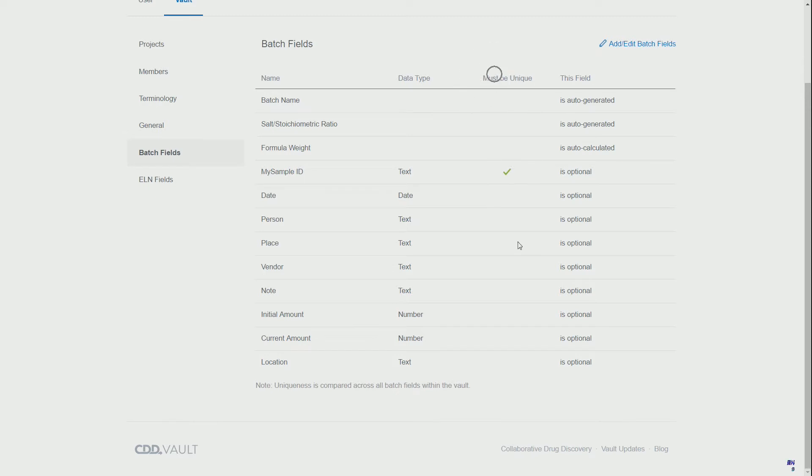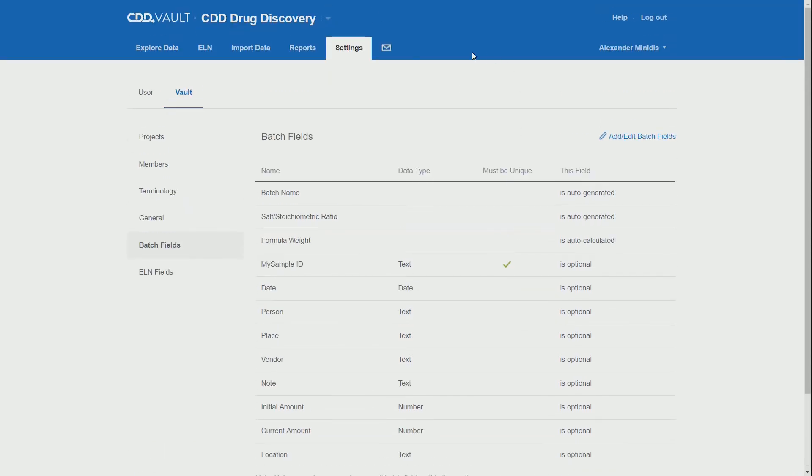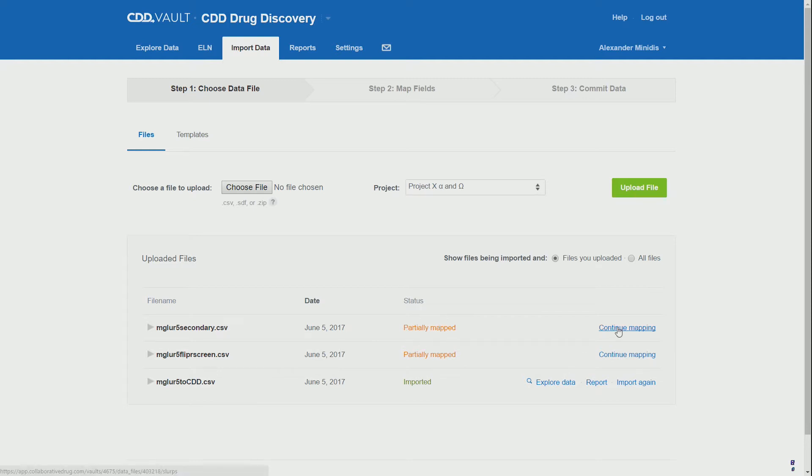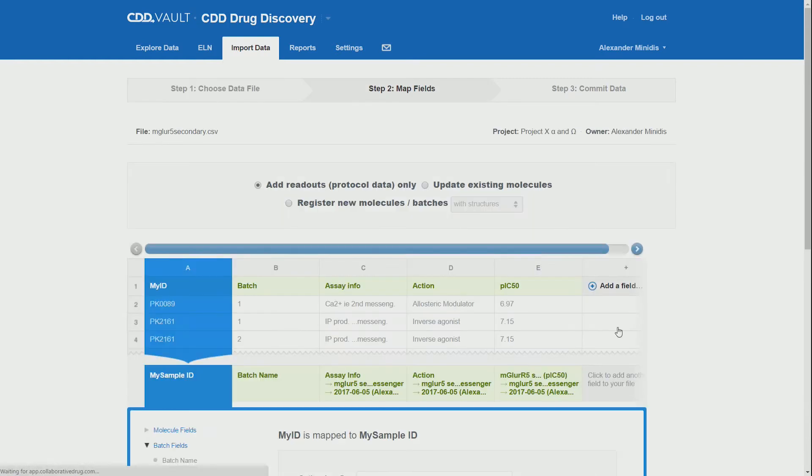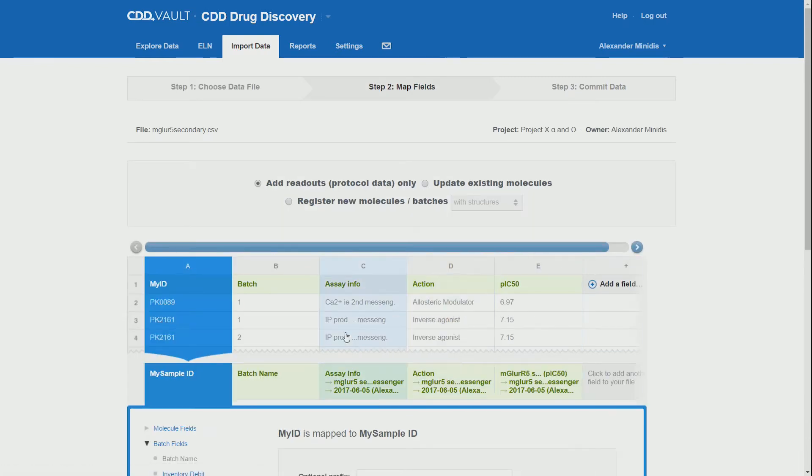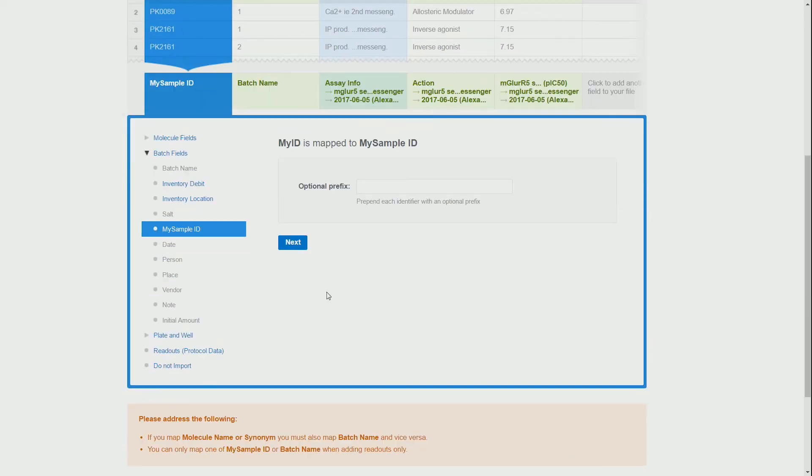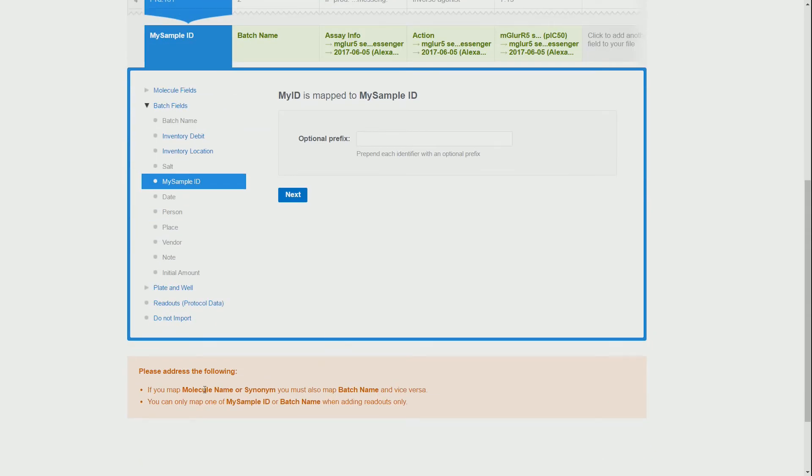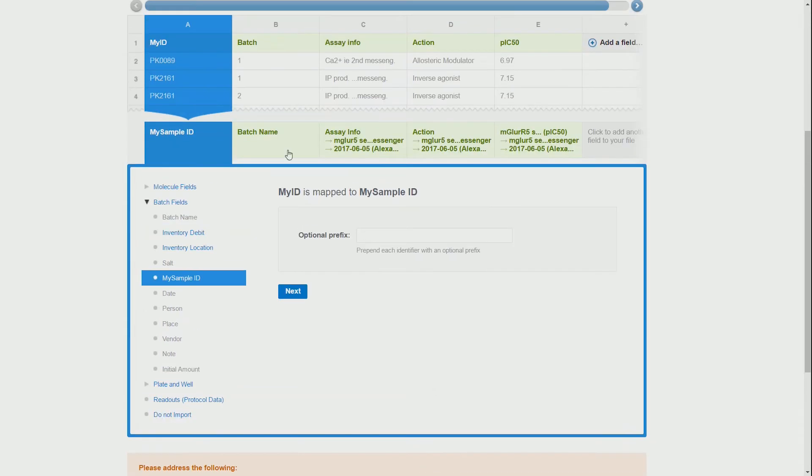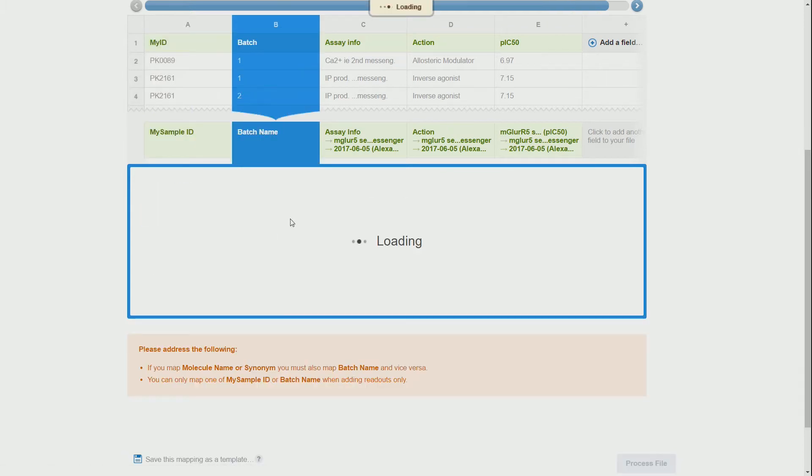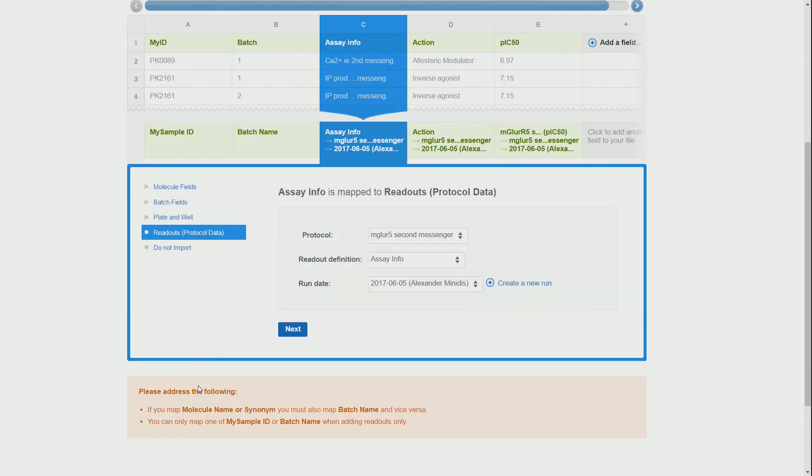Now we can go back to our imports. We can use the file that we already have partially imported. We make sure that we are in the readout section. We double-check the warning message on the bottom where it states that we can only use the ID or batch name when adding the readouts.